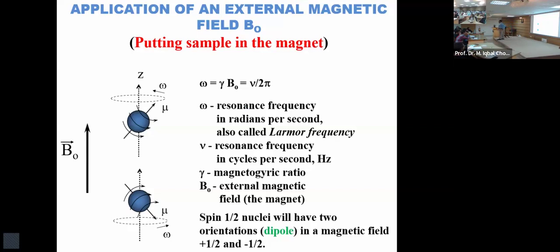And this is called the gyromagnetic ratio. It was experimentally measured, but it's not a magic number. It can be calculated for elements. It's related to mass over charge ratios. So the stronger the magnetic field, the stronger the precession frequency.